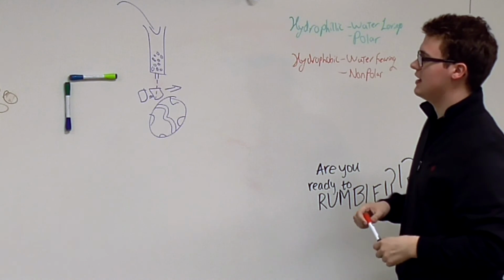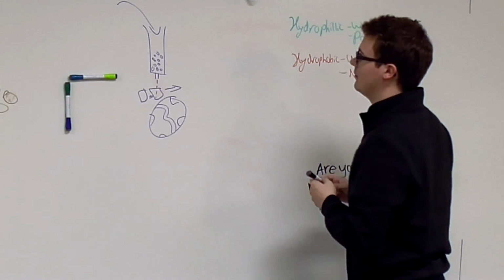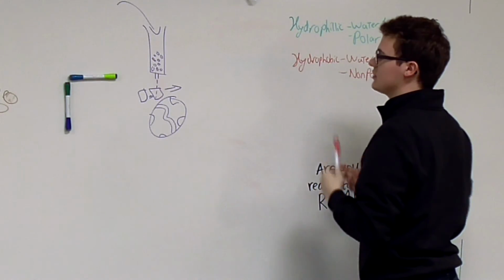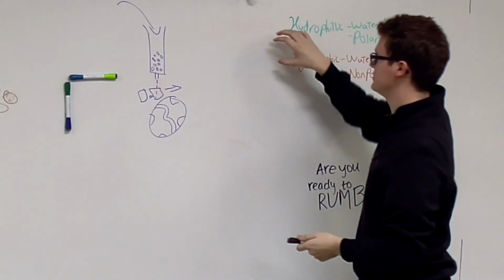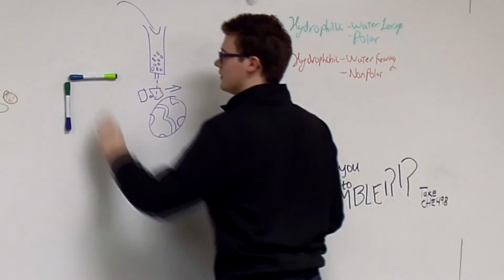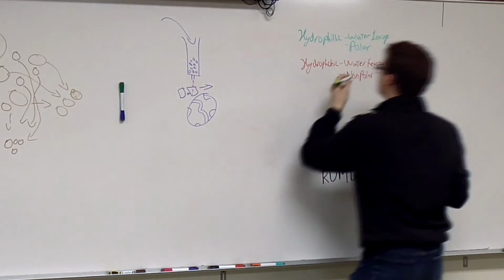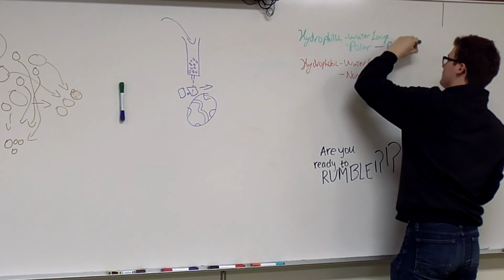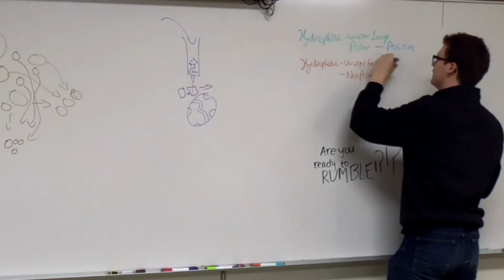Now, instead of your beads having tunnels and pores, perhaps they have a property that they share with one of these. Perhaps they are hydrophilic. And we expect certain molecules to take different lengths of time to get through, because these properties would separate them apart. And lastly, even in the hydrophilic region of polar, we have positive and we have negative.